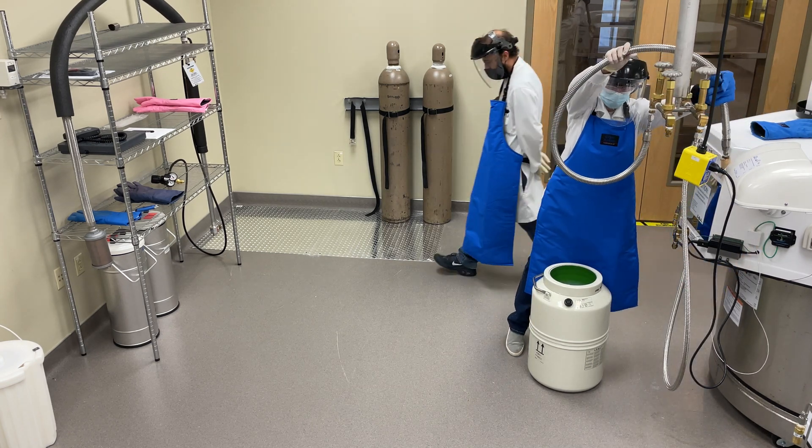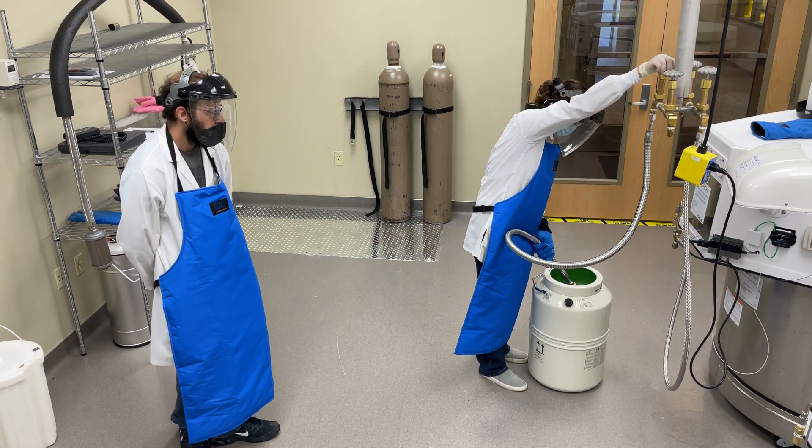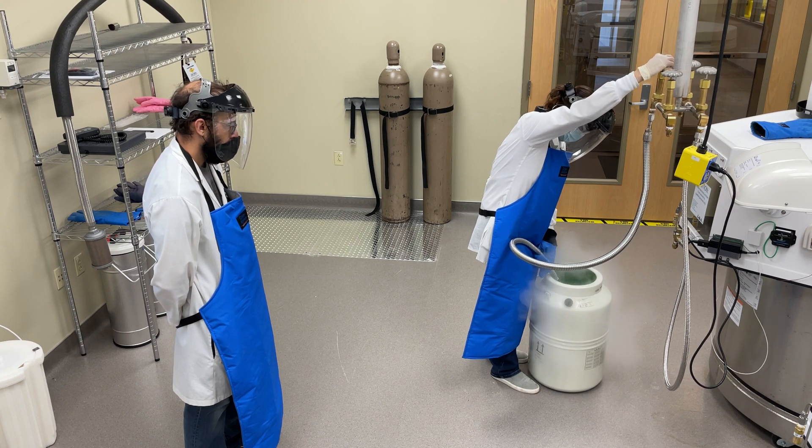Using an LN hose with a phase separator, fill the cryoshipper with liquid nitrogen to the bottom of the neck tube. Work slowly to prevent boiling of liquid nitrogen and accidental overflow during the fill process.